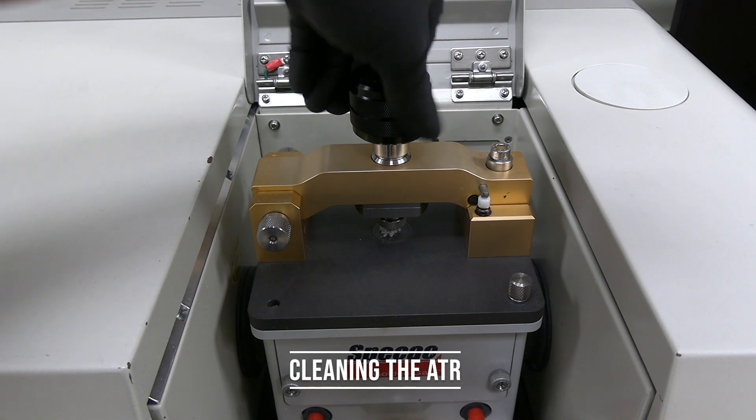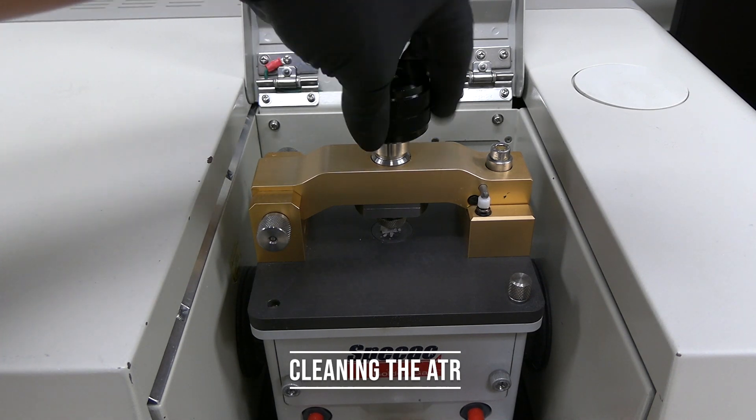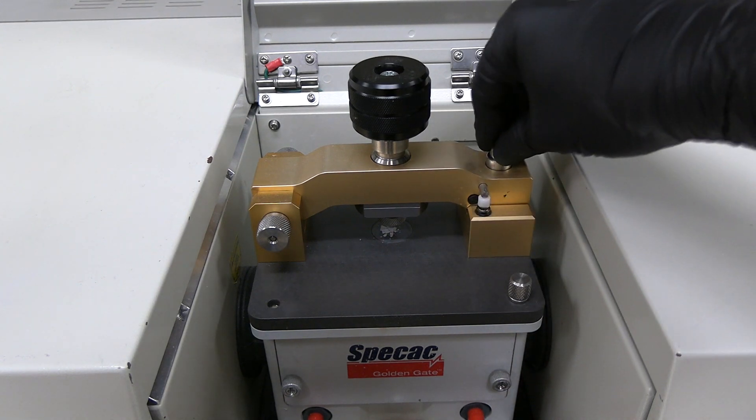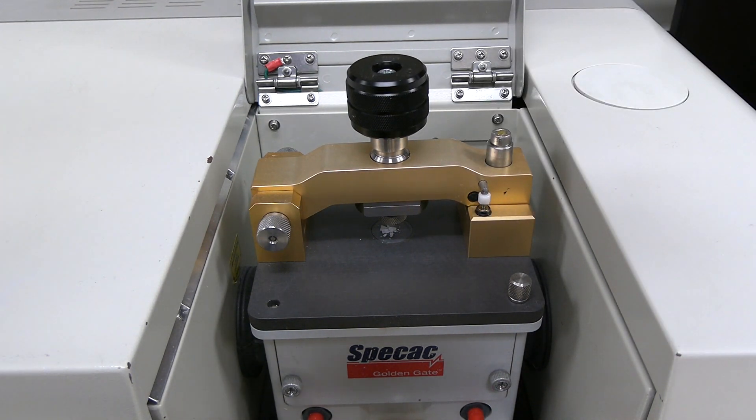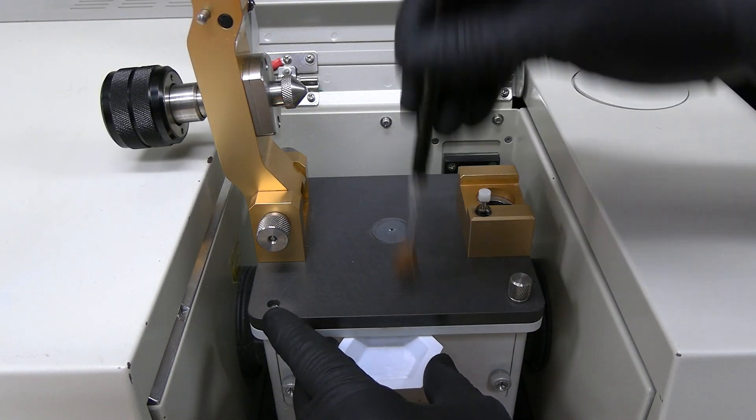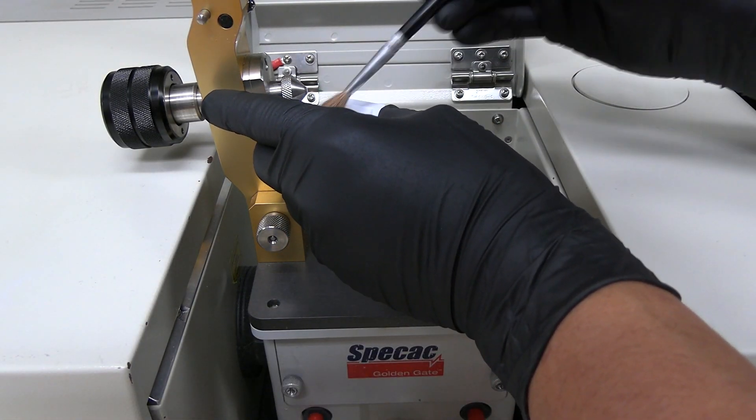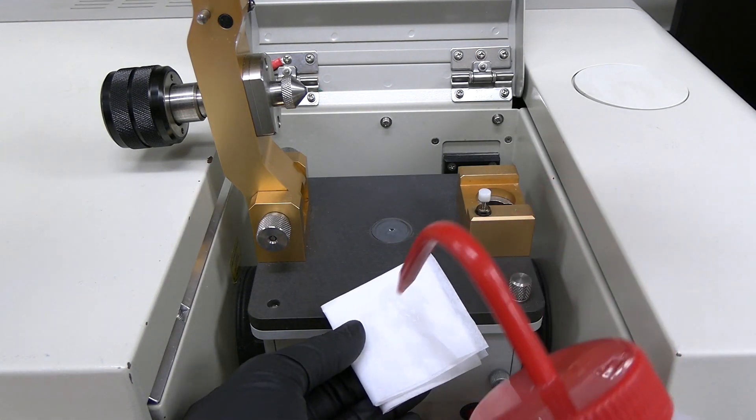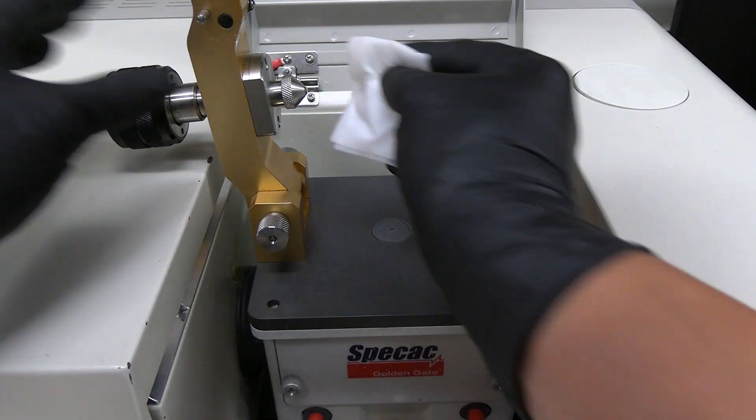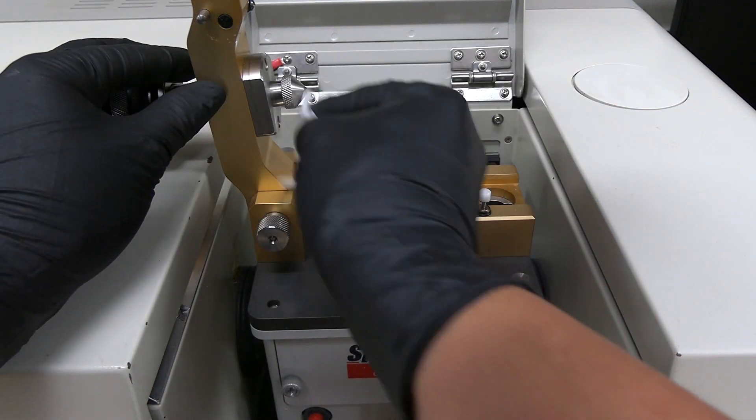Cleaning the ATR. Turn the anvil knob counterclockwise. Press the locking lug and turn it counterclockwise to release the anvil arm. Lift the anvil arm. Use a soft brush to wipe off the sample from the sample window and anvil. Moisten a kim wipe with acetone. Wipe off the sample window and anvil. Do not soak the sample window. Allow to air dry.